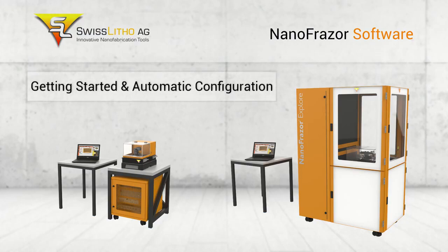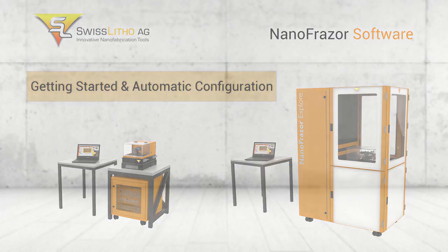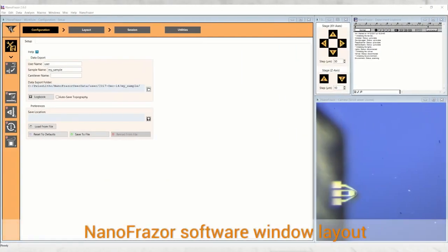In this video, you're going to learn how to get started with the NanoFrazor software and perform the automated configuration of the tool. This is a typical view of the NanoFrazor software with all the windows arranged automatically.